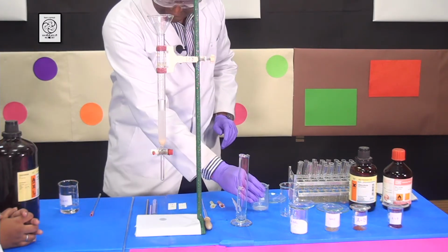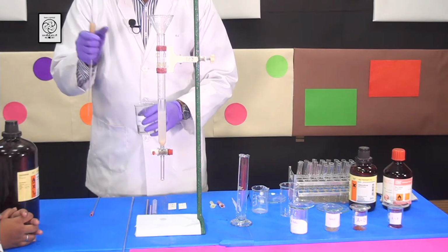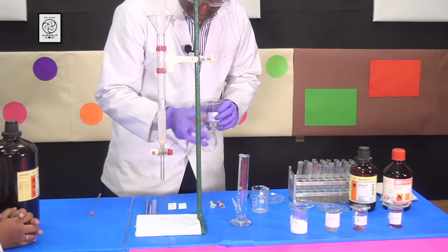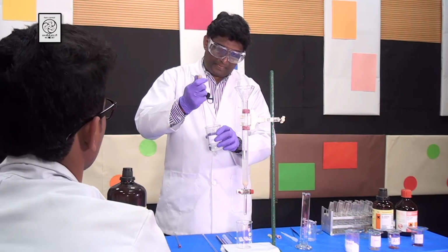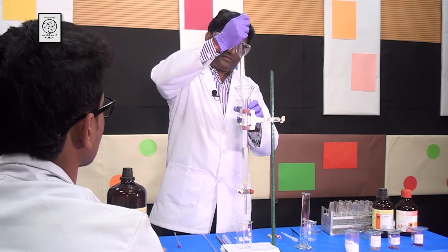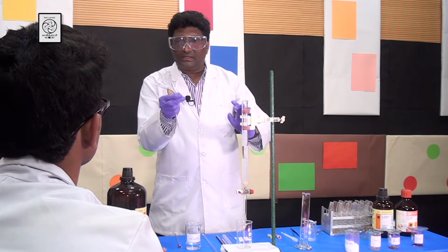Now I am putting this beaker aside. Now I am taking a glass pipette and I am going to wash the sides of the funnel and the column using the hexanes that I am going to use. But before that, I will put a beaker at the bottom so that the solvent doesn't fall on the floor. So I am washing the sides of the funnel so nicely. Now I am taking out the glass funnel because the silica gel is totally washed down and the funnel is washed out.